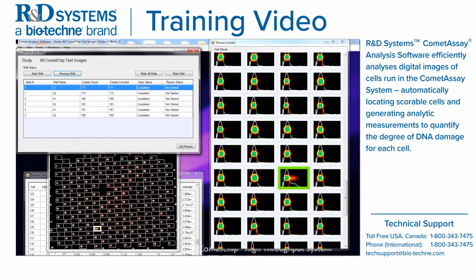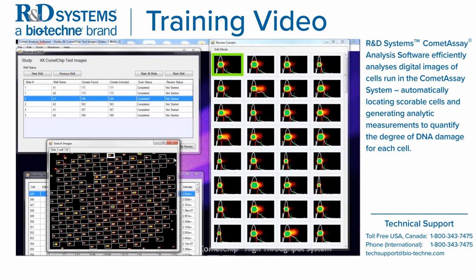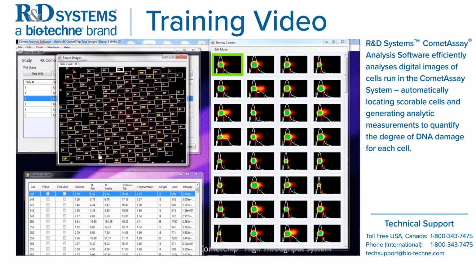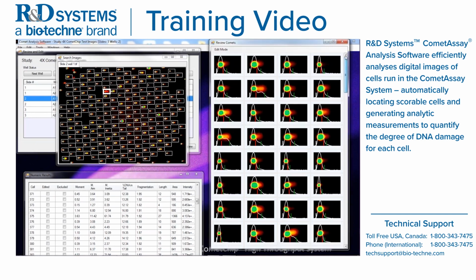So let's see if we can find some where the comets weren't in the grid. Oh, here's a good one. You're looking for a panel. So right here, this comet right here was not within the pore. So again, this would be one that I would automatically exclude. And so you can see it's excluded here.